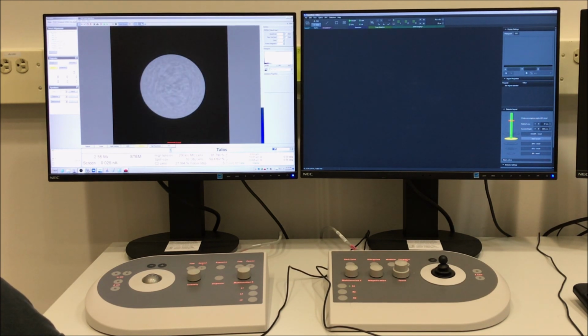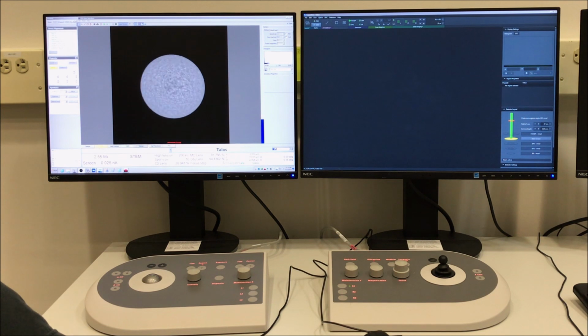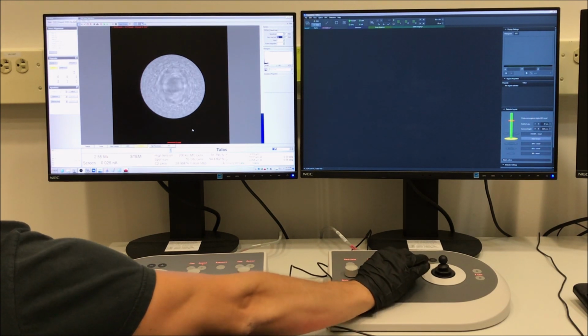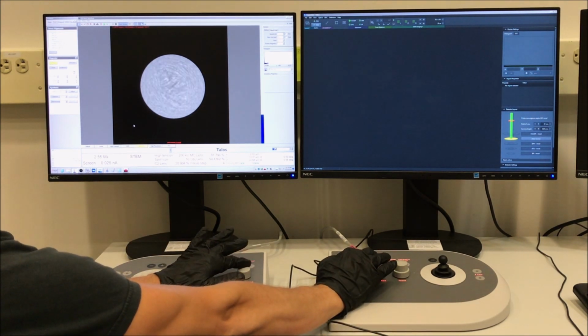I do like to manually adjust the exposure time for the FluCam to 50 milliseconds when doing this. You can do that easily by just deselecting the Auto checkbox in the Settings tab to the right of the FluCam, and then you can set the exposure time to 50 milliseconds. So you can adjust the focus until you see the flickering part in the middle of the Ronchigram, which is what you need to start with. The first step is to make the rings in the Ronchigram circular.